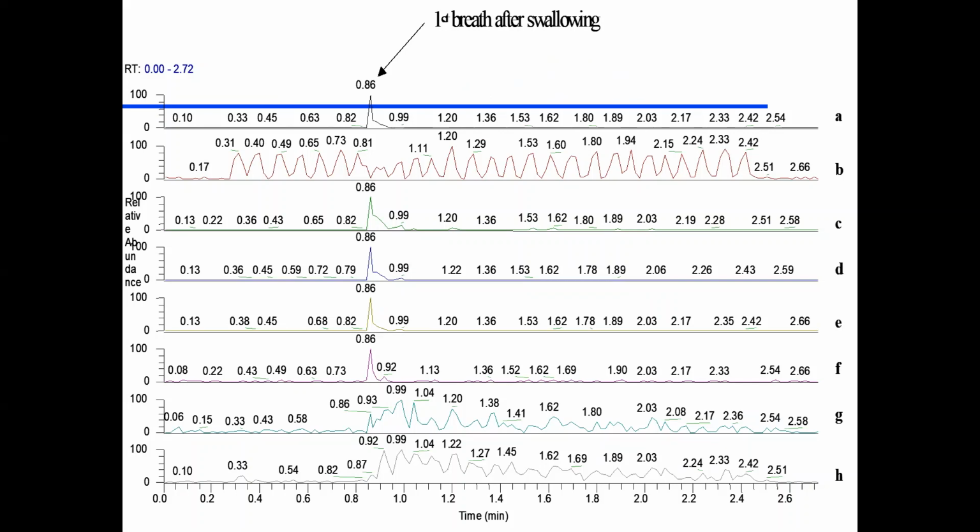And then this is one flavor compound in the mixture, second, third, fourth, fifth, sixth. So 6 different flavor compounds within that beverage. And you'll notice it's called the exhale breath, the first one. There's a good shot of one of the flavor molecules in that first breath, and then it declines very rapidly. This is another flavor compound, very similar pattern. Actually, all 4 of these volatile compounds are very similar. And when you look at their composition, they are chemically related compounds.